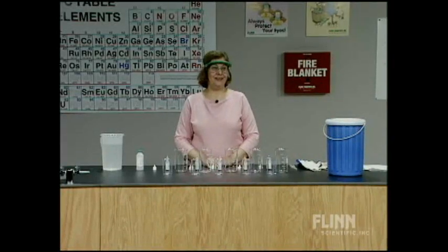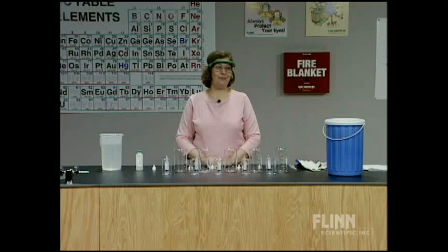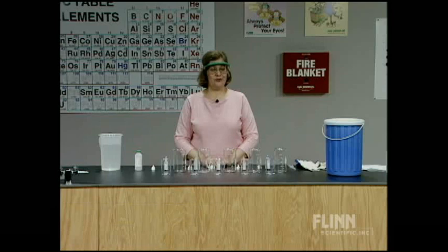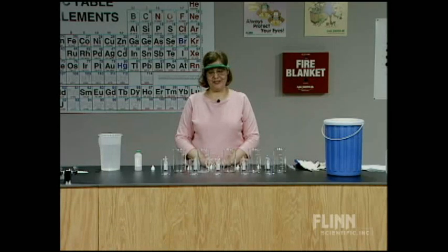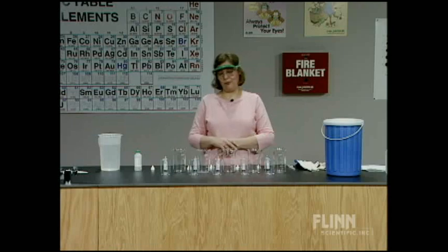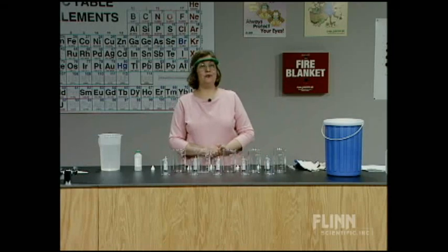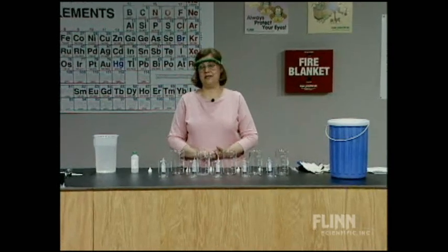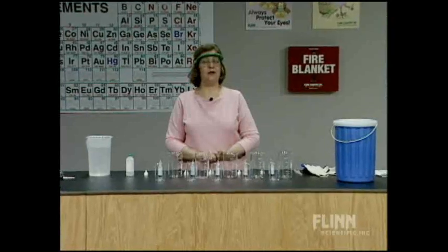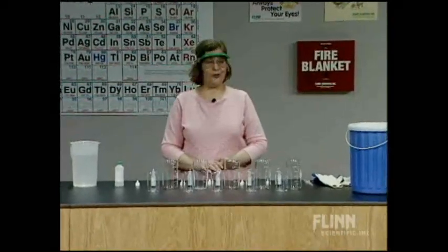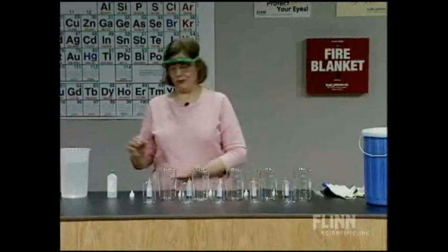Dry ice is a very popular material for demonstrations in chemistry. Who doesn't love working with dry ice? It's a unique material with unique properties. If you add it to water, it foams and bubbles. What we're going to do here is combine the properties of dry ice with an acid-base indicator to talk about the acidic properties of carbon dioxide dissolved in water. We're going to call this the dry ice color show.